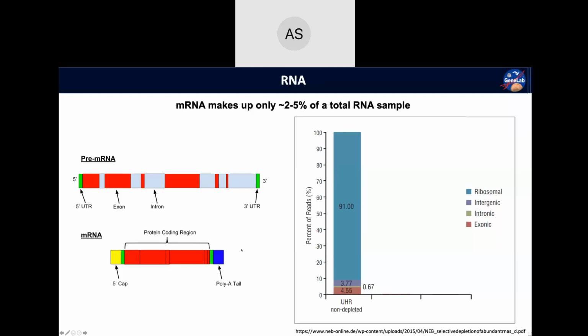And what we can do to help clean up or remove ribosomal RNA is, one way is through positive selection by taking advantage of this poly A tail. So we can create oligos that are complementary to long strands of A's or long strands of T's, depending on which forward or reverse direction mRNA you have. And then we can use that to bind to the poly A tail and pull out the messenger RNA. So this is a way to enrich for messenger RNA in your samples, because then we would only carry that pulled out mRNA through the rest of the process.